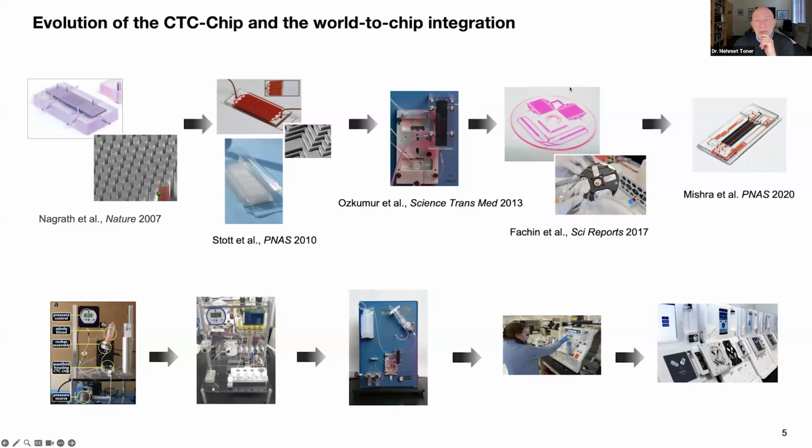And then we built, with help from Stratec, a monolithic chip that can actually do this at high throughput. We can't do this plastic manufacturing in our labs. At this point, our flow speed is about 20 million cells per second sorting. We can sort 2 tubes of blood in an hour.